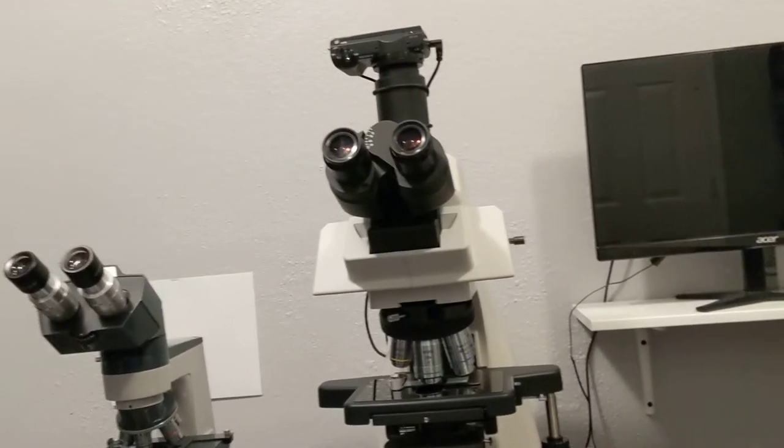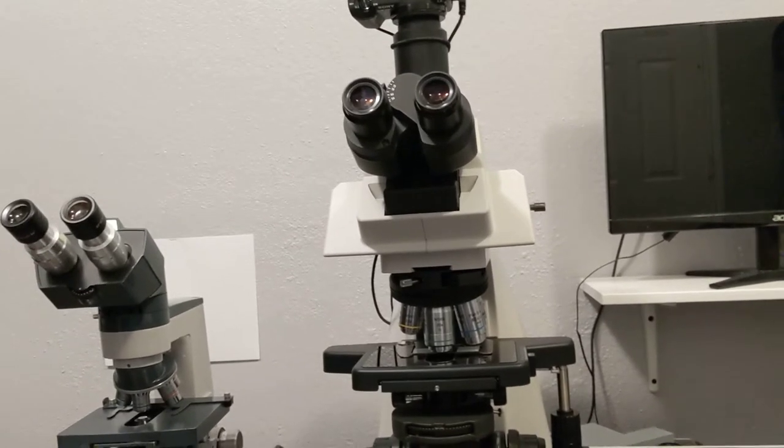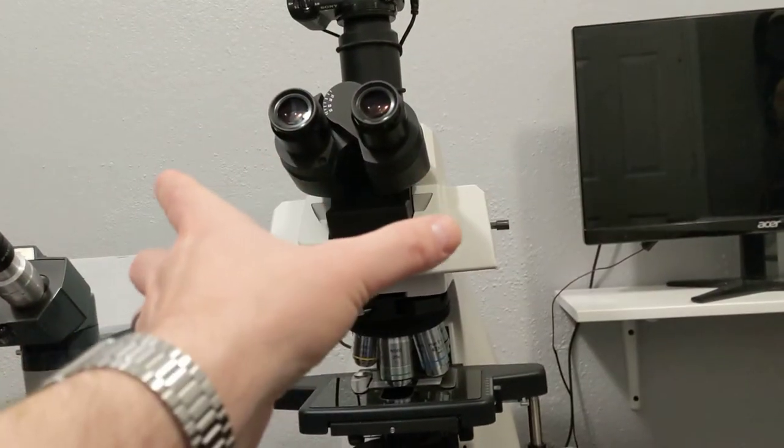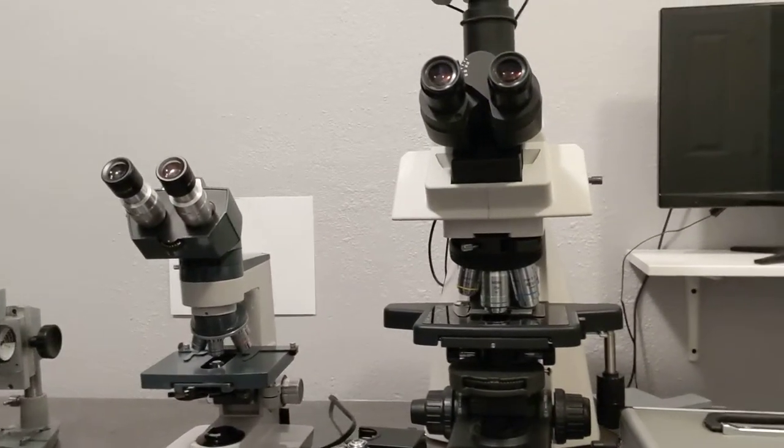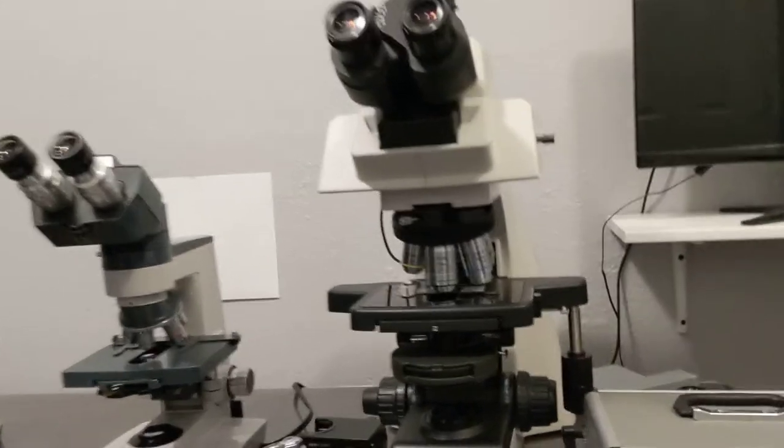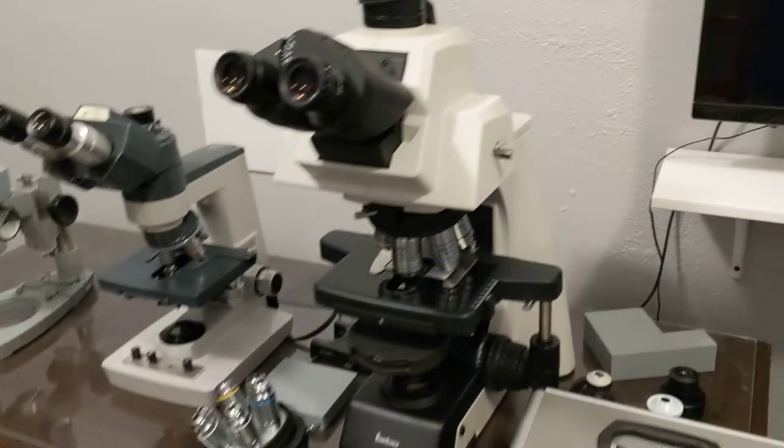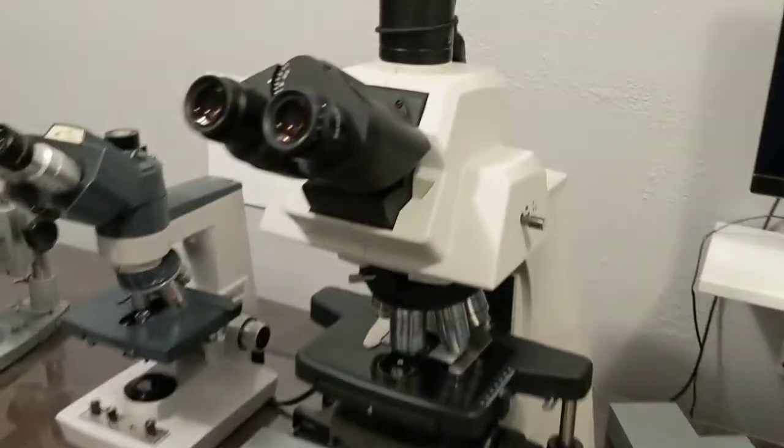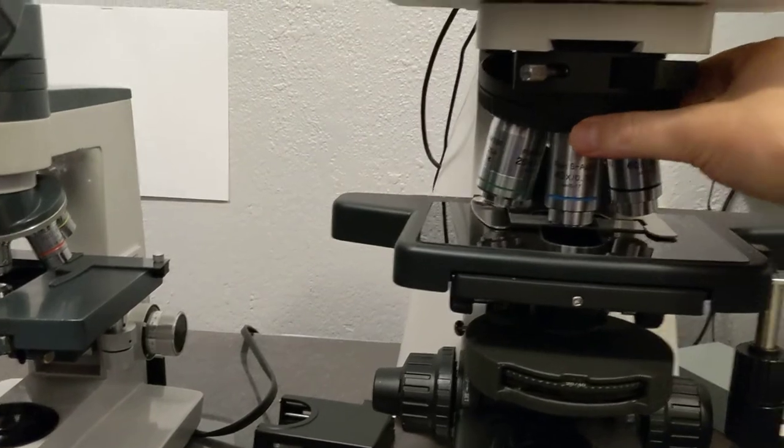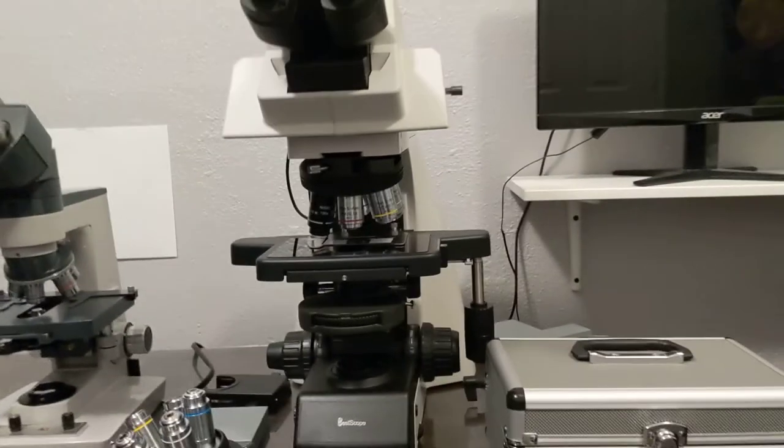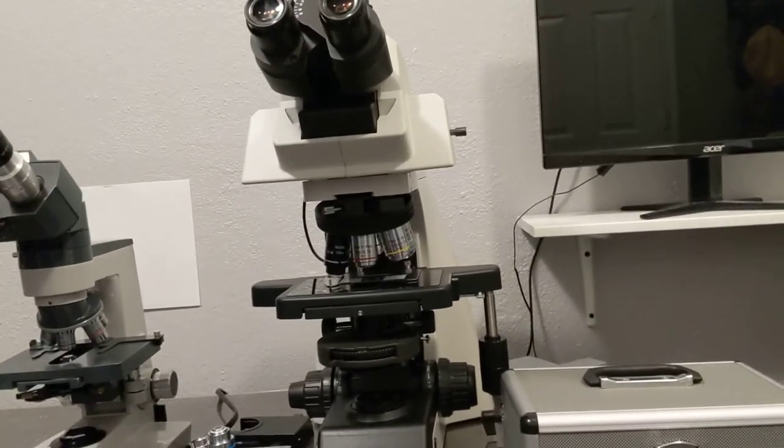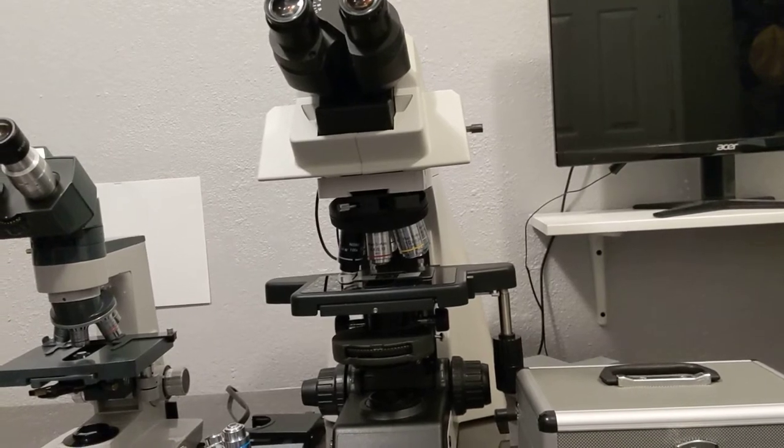I have a Nikon E400 microscope, and I took the head off of it and put it on here, and it fits mechanically and optically looks fine. The heads are completely compatible. These are the giant 60-millimeter parfocal objectives. They do a really good job. There's a lot of space within them to do all the kinds of corrections and light gathering.